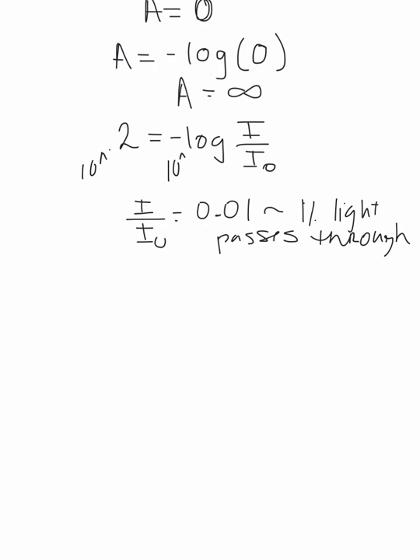Now, in my experience, I have always been taught that a good frame of reference for making measurements is to keep your absorbance values between 0.1 and 0.9 absorbance units. By the way, I actually shouldn't put an A there, because absorbance has no units.